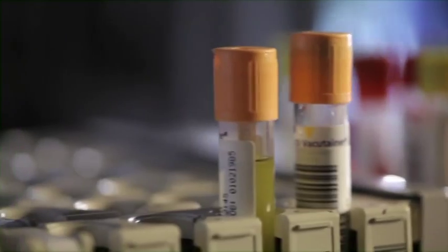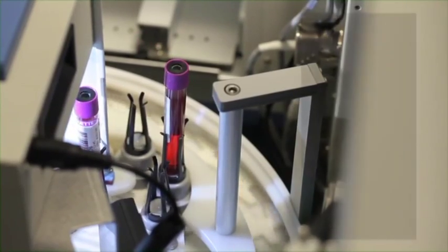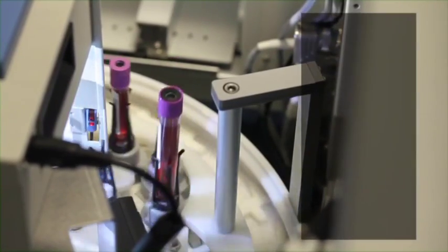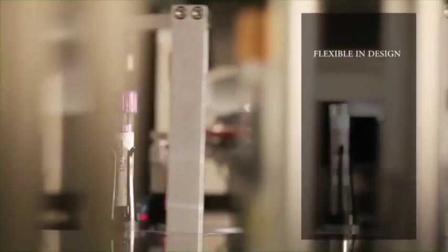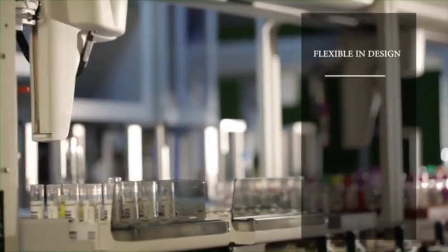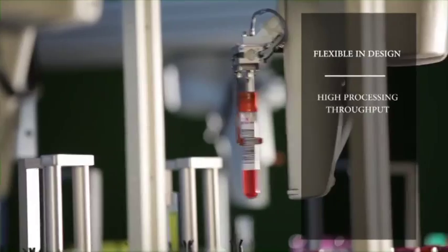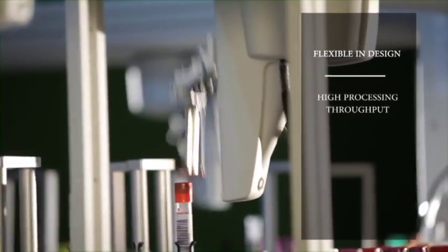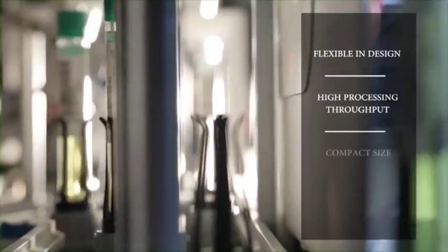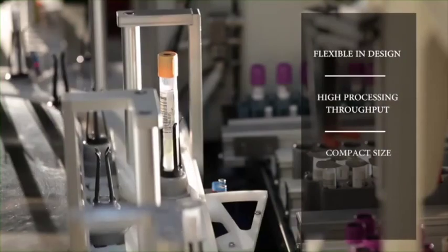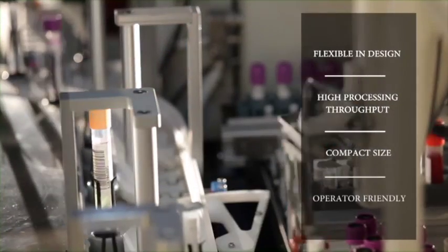What makes the Pathfinder 900 Plus attractive as an automation solution is its complete flexibility in the way it can be customized to any laboratory, its high sample throughput to meet the most demanding workload, its compact size, and its operator-friendly design.